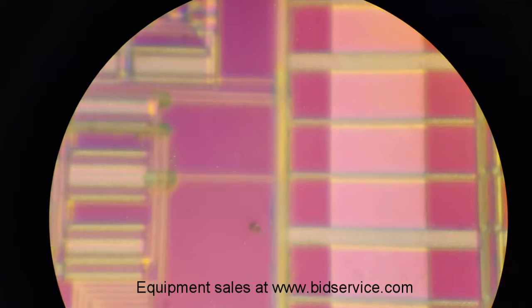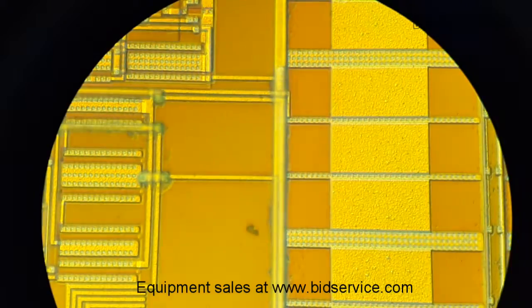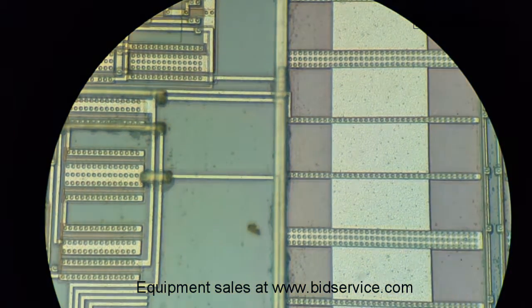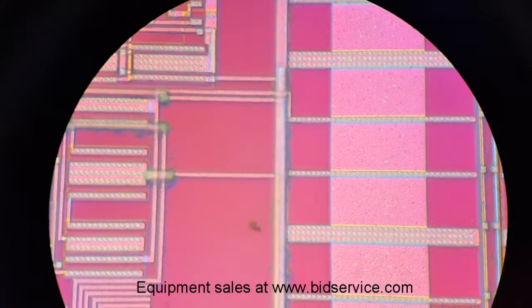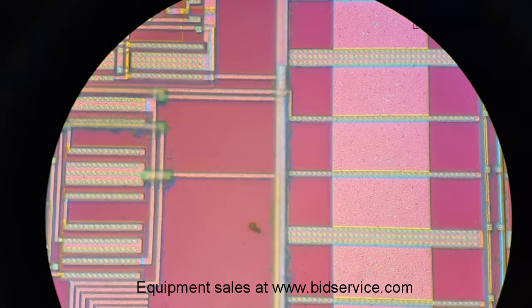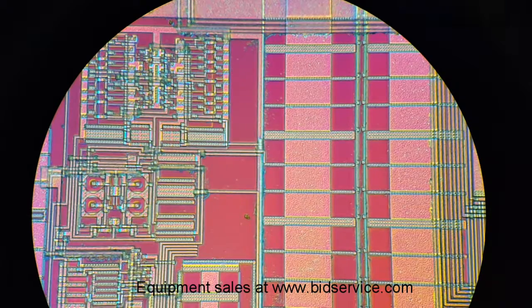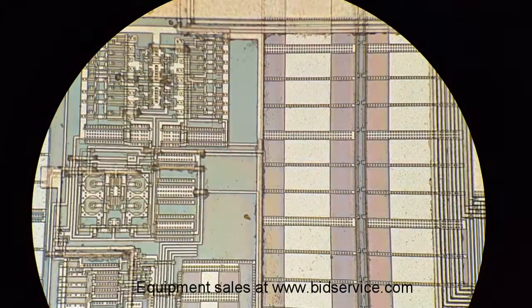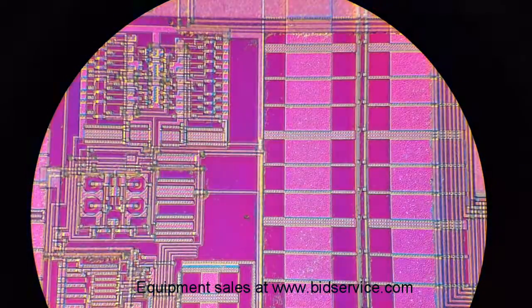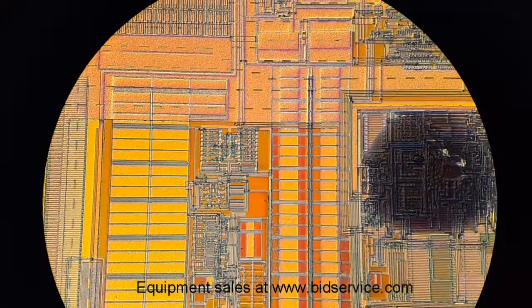We'll go down to 100x with a little bit of fine focus, and move the prism in or out. Here's the 50x — didn't really need any focus adjustment — and we'll turn the prism.